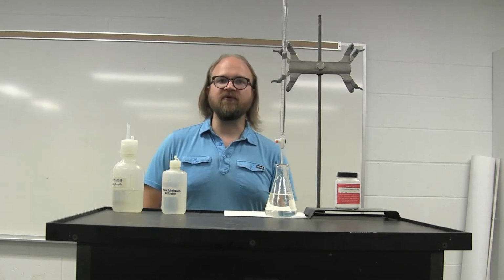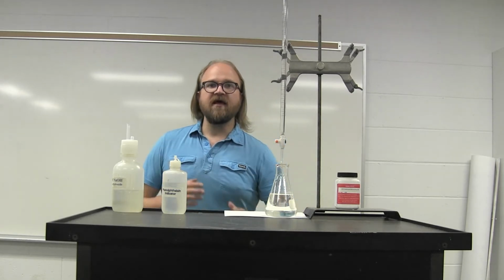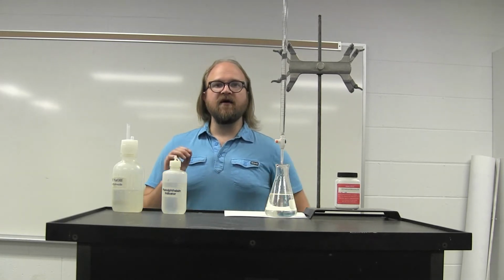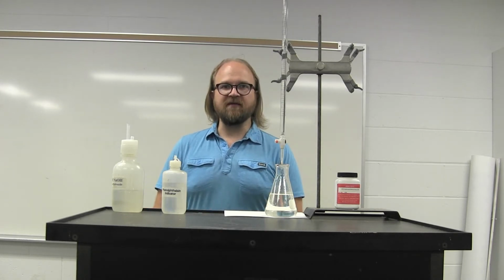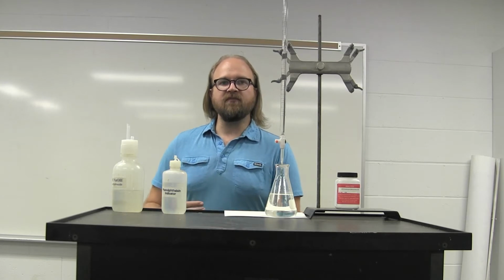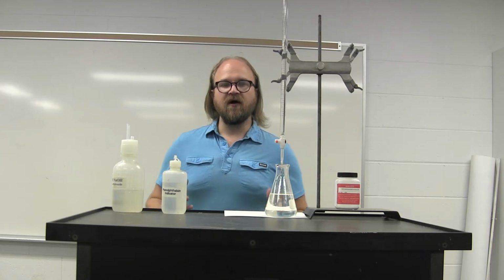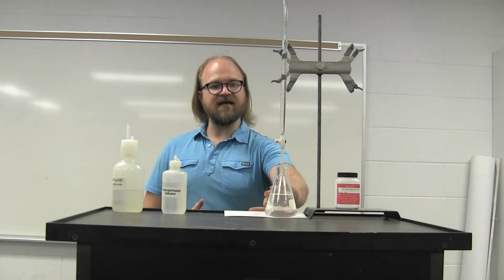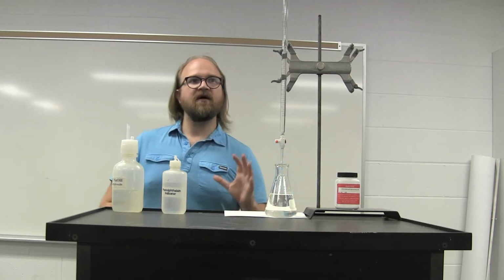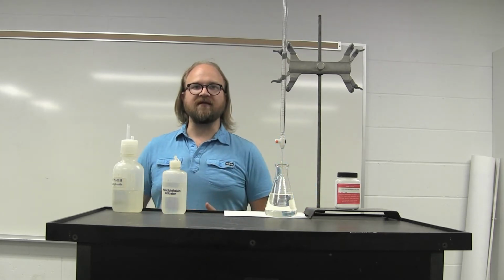Titrations are a laboratory method where one component of the reaction is very precisely added to the other component in order for the reaction to take place. You can either perform titrations to reach a stoichiometric endpoint, that is where all of the material in the flask equals the material that is added from the burette, where the reaction is perfectly balanced.